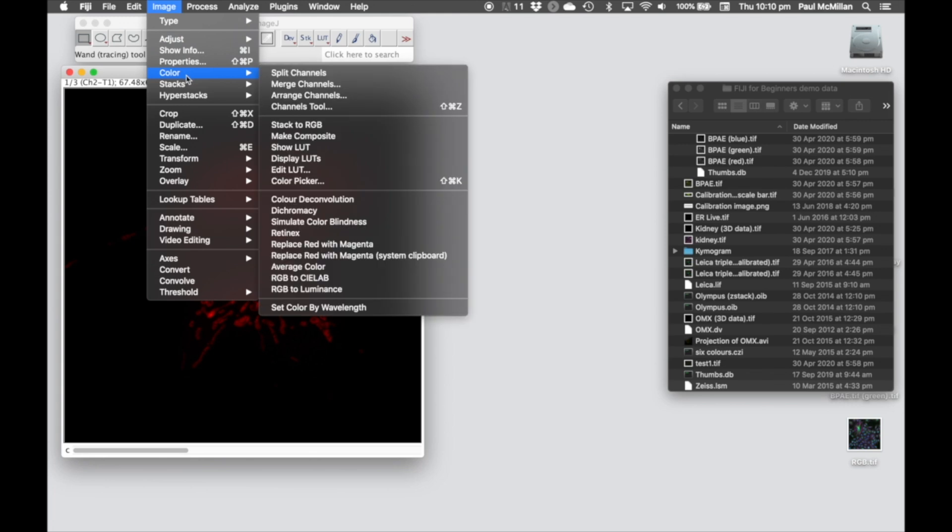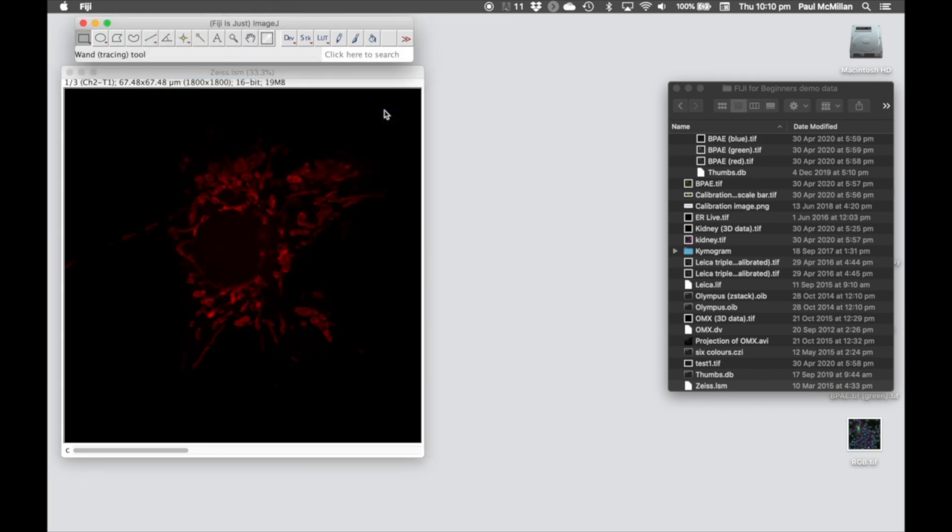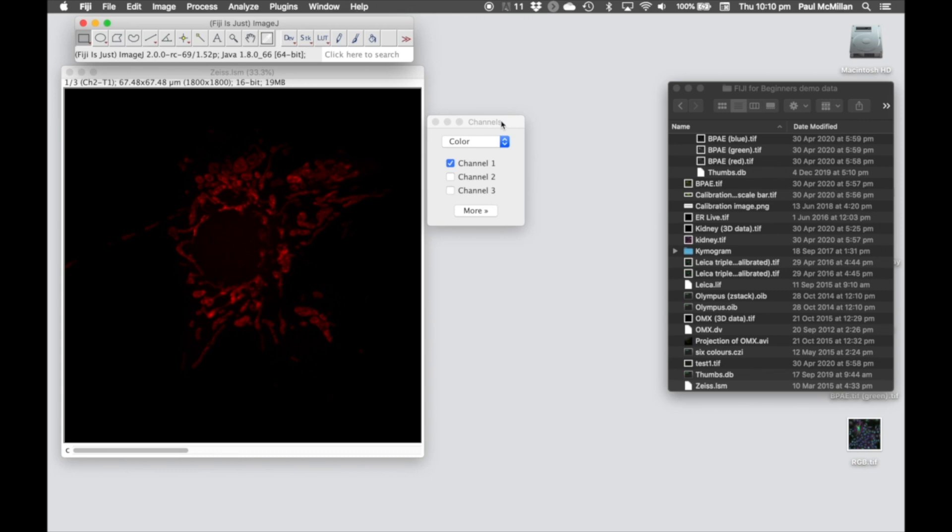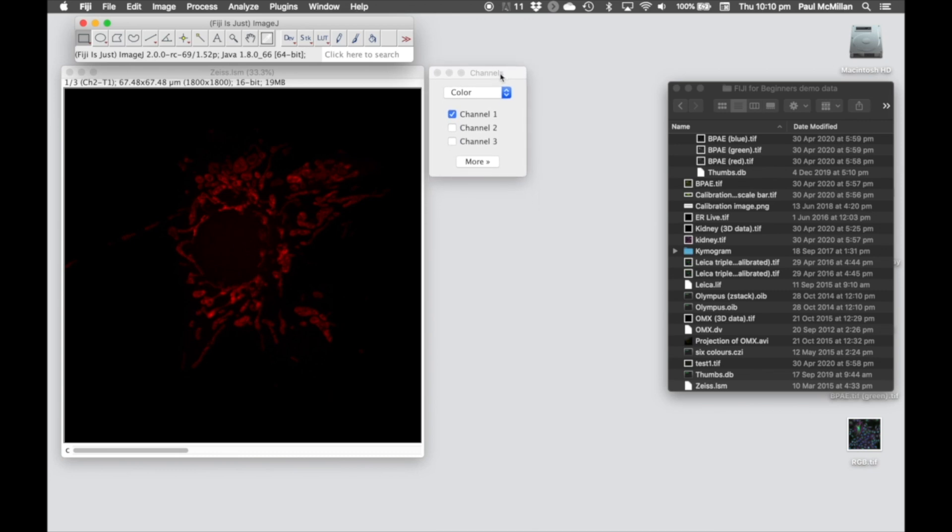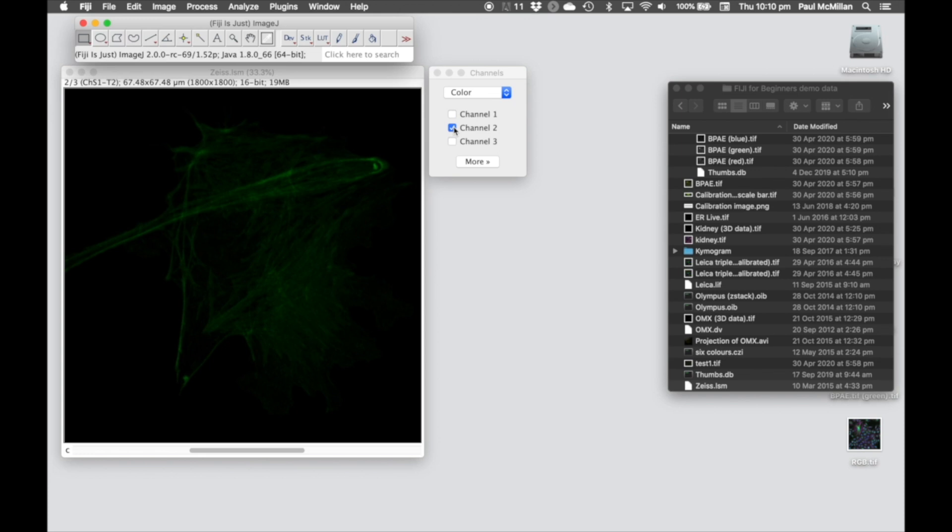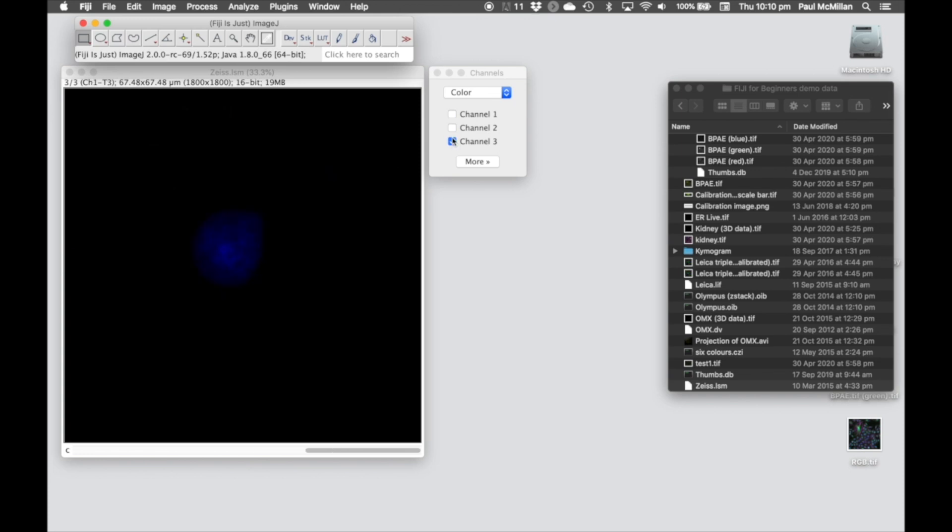So in this case, we're going to use the channels tool, which is Control-Shift-Z on a PC, or Command-Shift-Z for a Mac, and then this brings up this dialog. So as long as we're on color, we can toggle between the different channels.